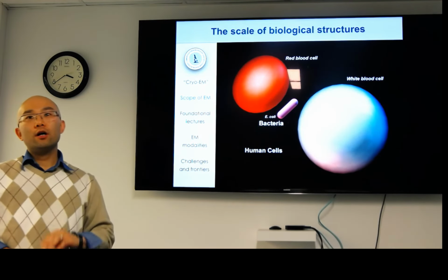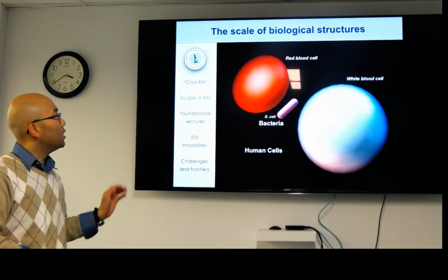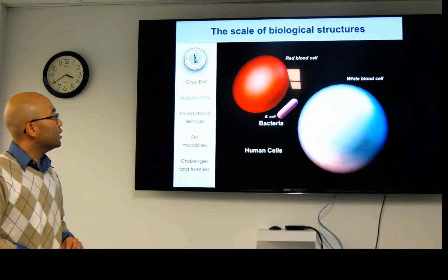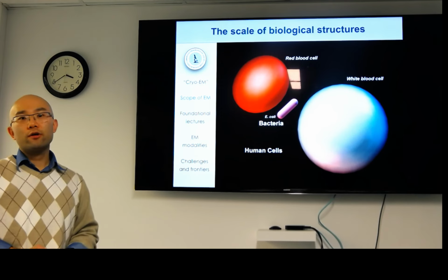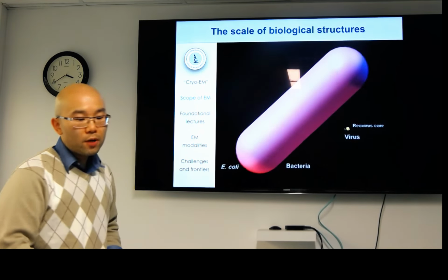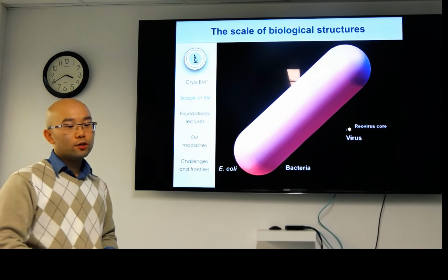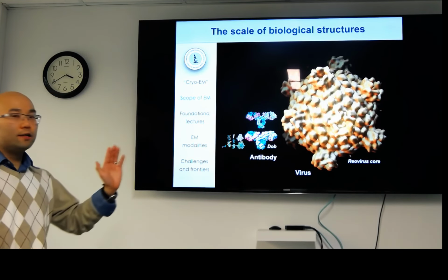But at the center, a lot of questions we get depends on the system they're coming from. Some people say biology is organisms, and they're interested in tissue-based or neural networks. Other people are interested in particular cells. You know, for example, the scale of a cell is somewhere around microns, like 5 to 10 microns, maybe even smaller. Some people are interested in viral entry into cells, and then you're going from the micron level towards the nanometer level. And some people are interested in structure function studies when they get to the nanometer angstrom level.